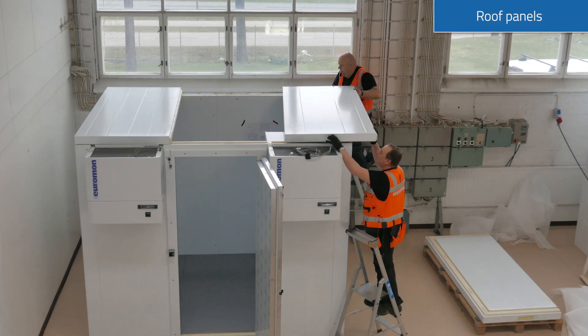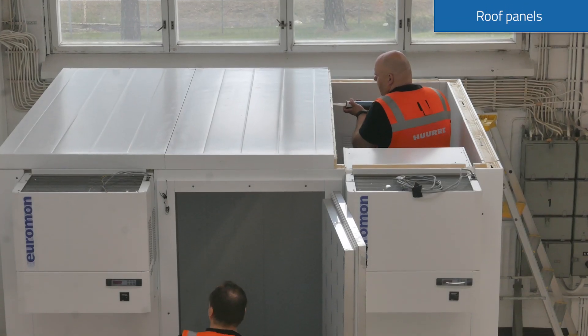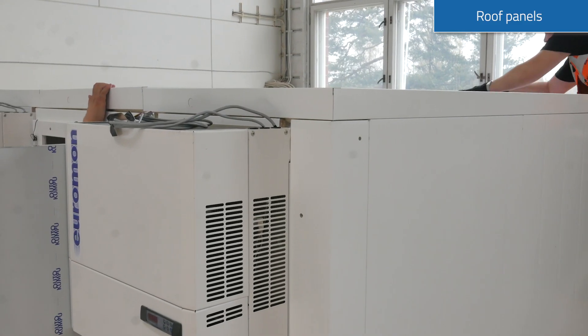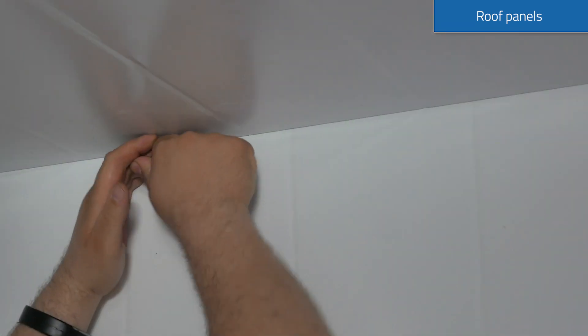Lift the roof elements on top of the wall and slide them into place. Please remember the silicone on every seam. Lock the roof elements together before locking the roof to the wall elements.